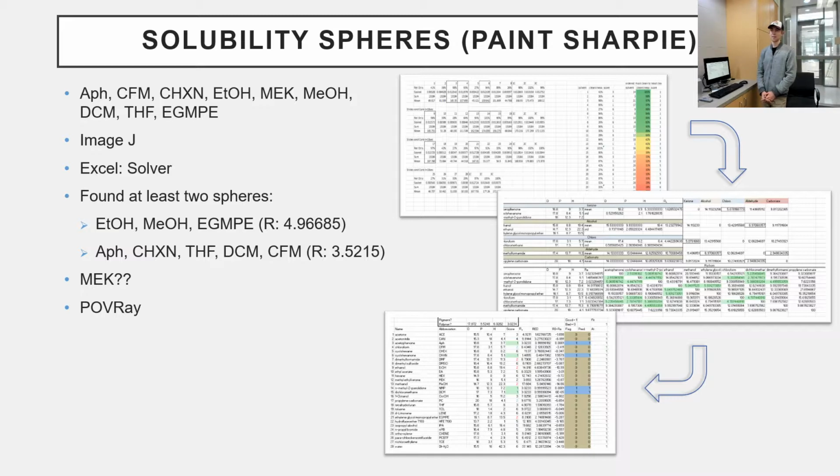So even though people may not have Sharpie as their soil, it represents a sticky, sooty soil that's nearly impossible to remove. Also, on those frosted glass slides, it gets into the rough surface, which is the difficult part too. So we have a rough surface with a sooty, sticky soil, which makes it a really good soil. If you clean sticky, carbony, black stuff off your parts, then Sharpie's a good substitute.